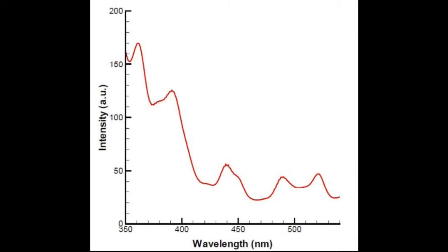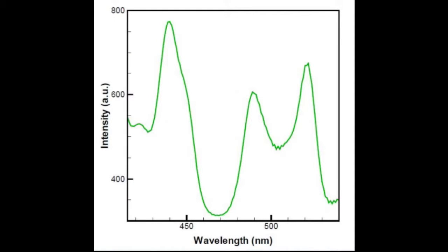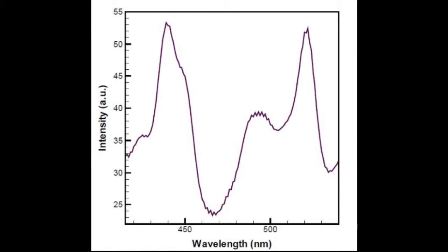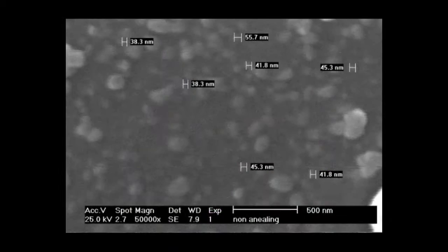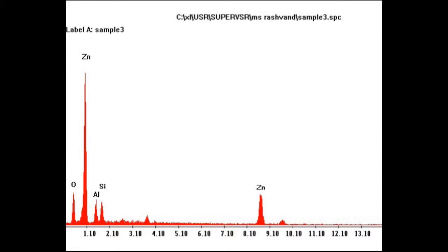In this region of the electromagnetic spectrum, molecules undergo electronic transitions. This technique is complementary to fluorescence spectroscopy in that fluorescence deals with transitions from the excited state to the ground state, while absorption measures transitions from the ground state to the excited state.